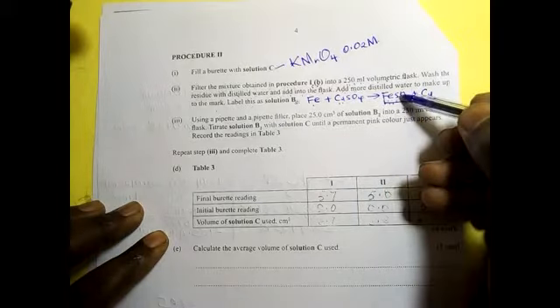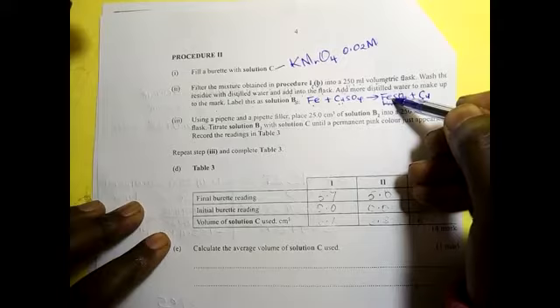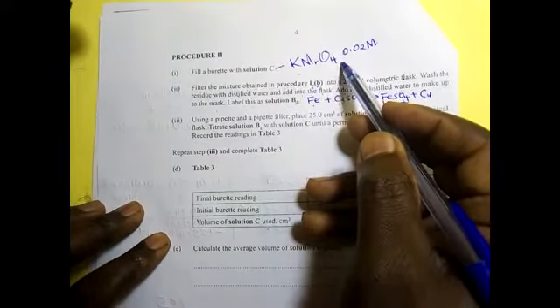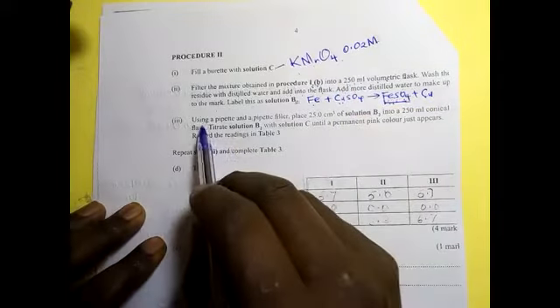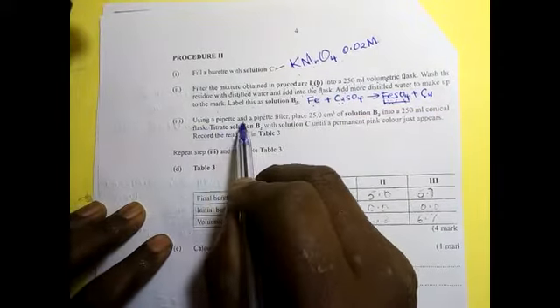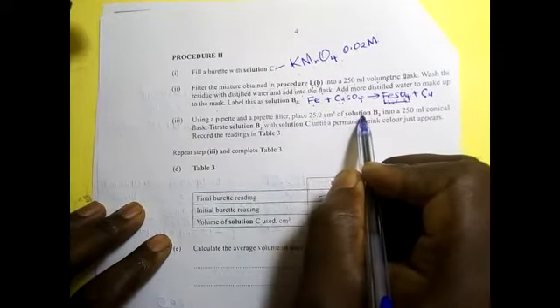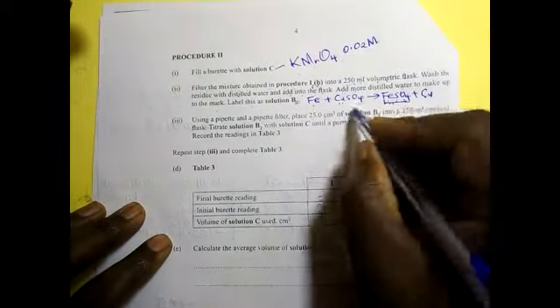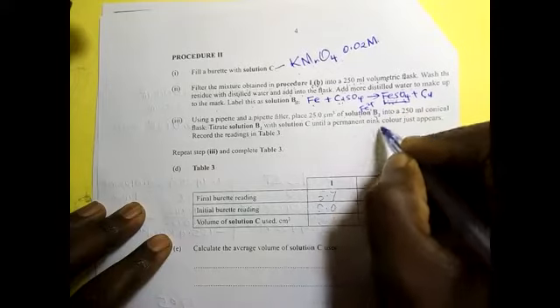So we are going to react iron 2 sulfate with acidified potassium permanganate. That is the understanding you need to have. So using a pipette and a pipette filler, place 25 centimeters cube of solution B2. Remember, this is a solution which contains iron 2 ion.